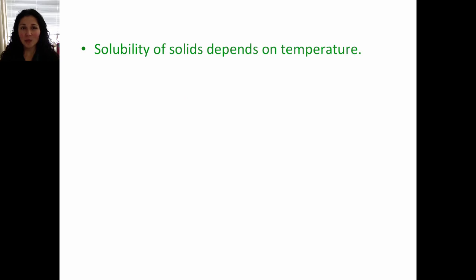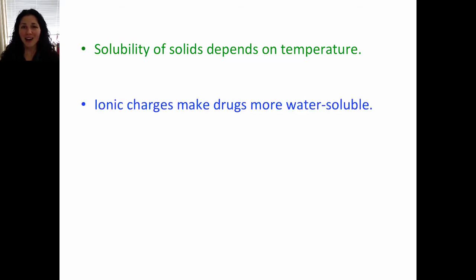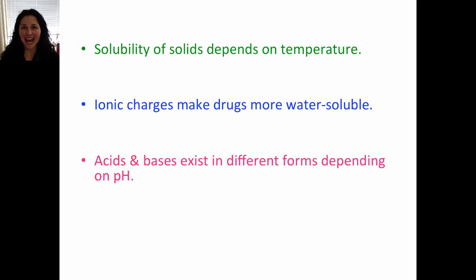Before this lab, it's a good idea that you review solubility of solids, and remember that solubility of solids depends on temperature. Also remember that ionic charges make drugs more soluble in water, and that acids and bases exist in different forms depending on pH. If you want to review this information, click on the links that are available now.